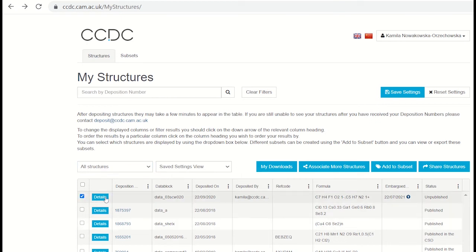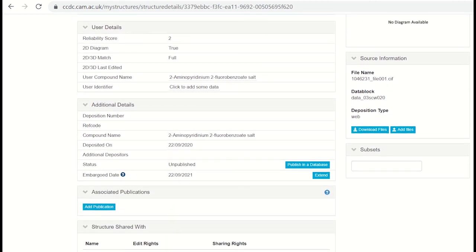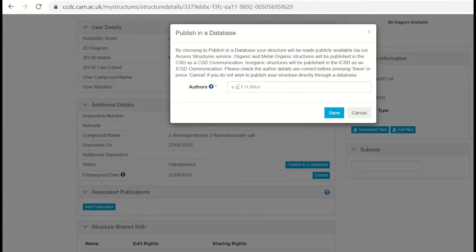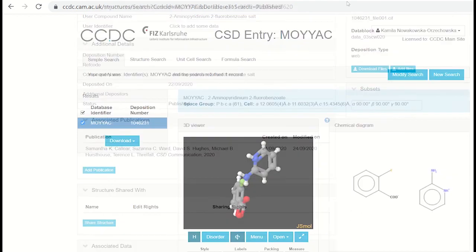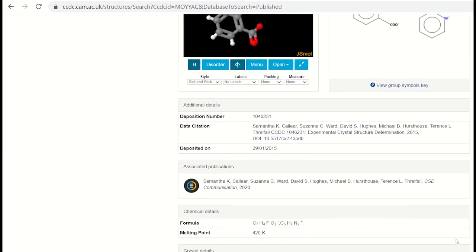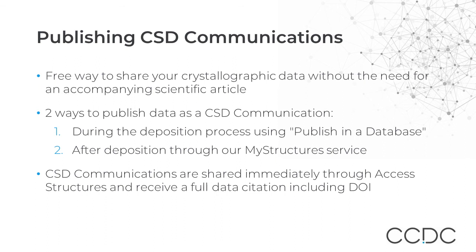Open the record by clicking on Details and scroll down to the Publication section. If your data has never been published before, you will see the 'Publish in a Database' button. Once you press this button and add all the authors according to our guidelines, the year will be added and the data will be made available immediately. Please bear in mind that the year of publication is always set to the current year by default. Each year we also send thousands of emails to depositors of unpublished data to remind them of this possibility, so if you do have unpublished data, we will contact you.